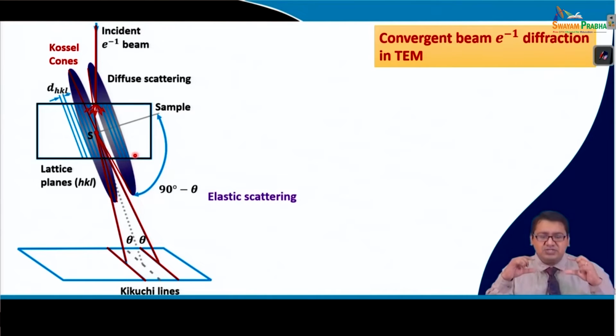So, it is prepared in such a way that at the thin position one can get diffraction spots, and one can go to thicker and thicker positions to see whether Kikuchi bands can be obtained because of multiple scattering.